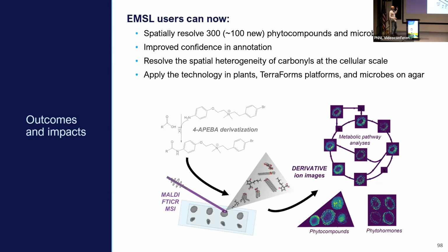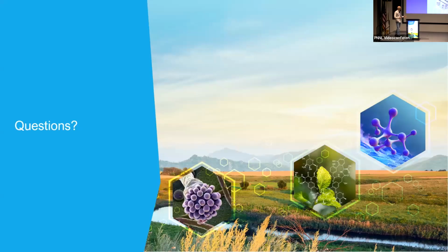And of course, this is applicable to different types of samples, root cross sections, stems, leaves, but also our microfluidic devices and microbes that grow on agar. With that, I would like to thank you, and I'm open for questions.